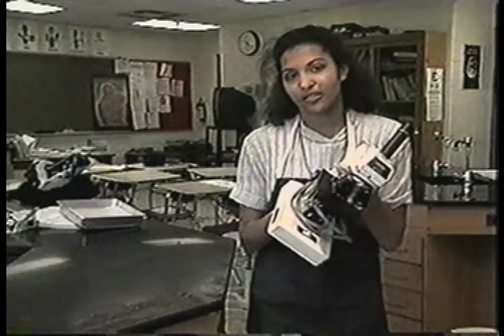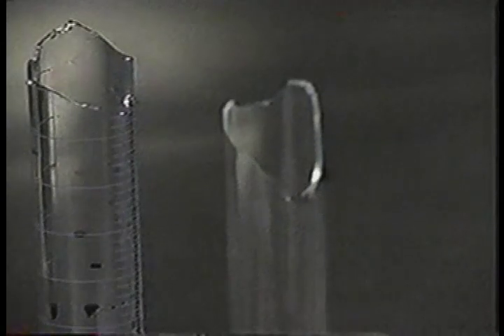With a microscope. You'll be working with lots of different equipment in the lab. Always be sure to handle the equipment with care, like this microscope. When carrying it, be sure to put one hand right up here on the arm and another underneath for support. A little slip and you could either break this expensive microscope or your foot. Ugh. Always inspect whatever you're going to use before you use it.